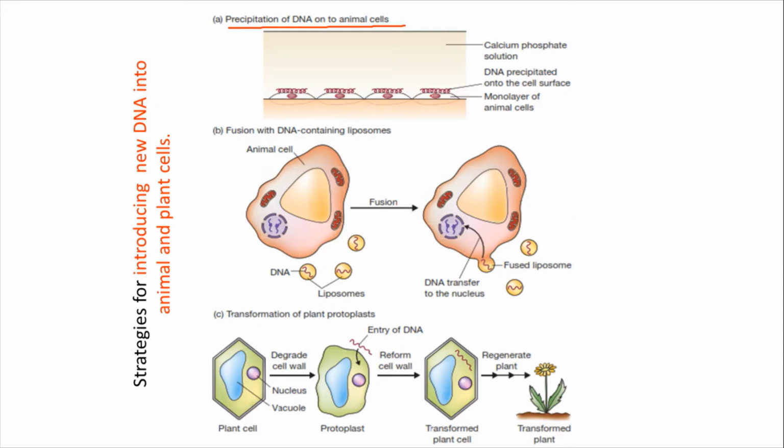By the mechanism of salting out, the recombinant DNA gets precipitated and binds to the surface of the plasma membrane. Maybe it gets inserted. The inserted fragment can further proceed to replication, transcription. Okay, this is an old method, but it has some demerits, and that is why people go to sophisticated gene transfer techniques.